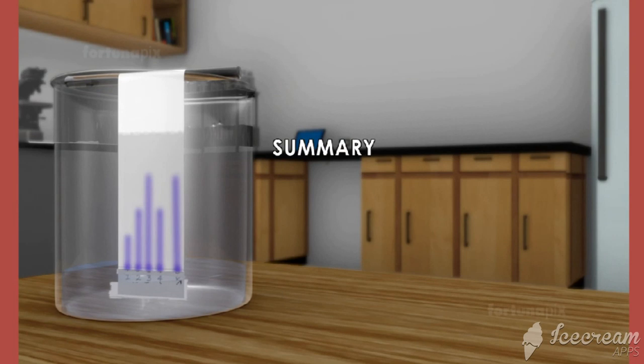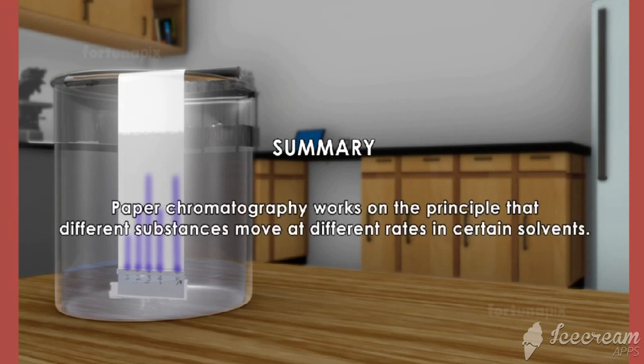Summary: paper chromatography works on the principle that different substances move at different rates in certain solvents.